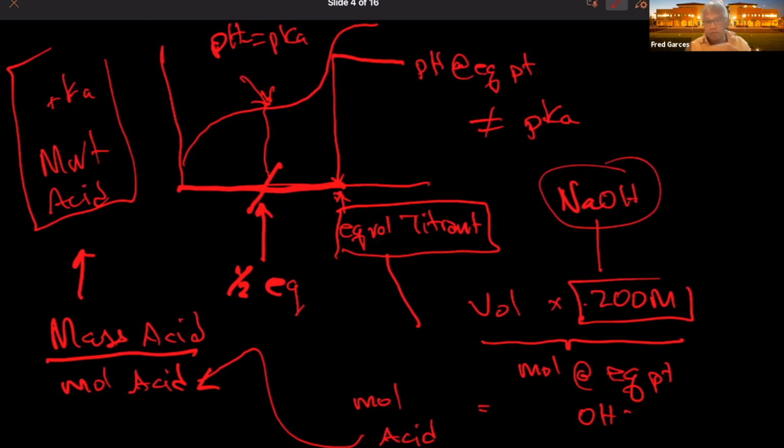Okay, the third one's going to be skewed more often than not to the correct value. So if you do 1 or 2 trials and they're really apart, you don't know which one to believe. If you do a third one, then it'll kind of skew you in one direction or the other. The other thing is that you can do statistics with 3 trials.